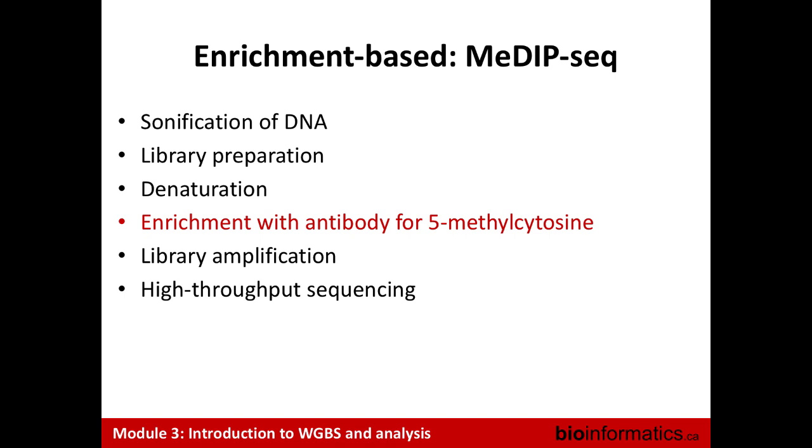But one thing that was said that I think is very true about the limitation of this is that it's an enrichment, right? So if the region is highly methylated, you get higher signal, but depending on the CpG density, as you were saying, it's still a little hard to interpret the result, because all you know is that it's enriched. Even if we think about ChIP-seq, it's not really quantifying, right? It's not a digital measurement of how many of the Cs were methylated. It's roughly that this region is highly methylated, so it comes down in your pull down. So that's one of the things that makes this type of data harder to analyze. In ChIP-seq, in terms of quantification of peaks, it's really hard to interpret the height of those peaks in some cases. As we'll see when we're actually doing the conversion and counting, it's much more quantitative.